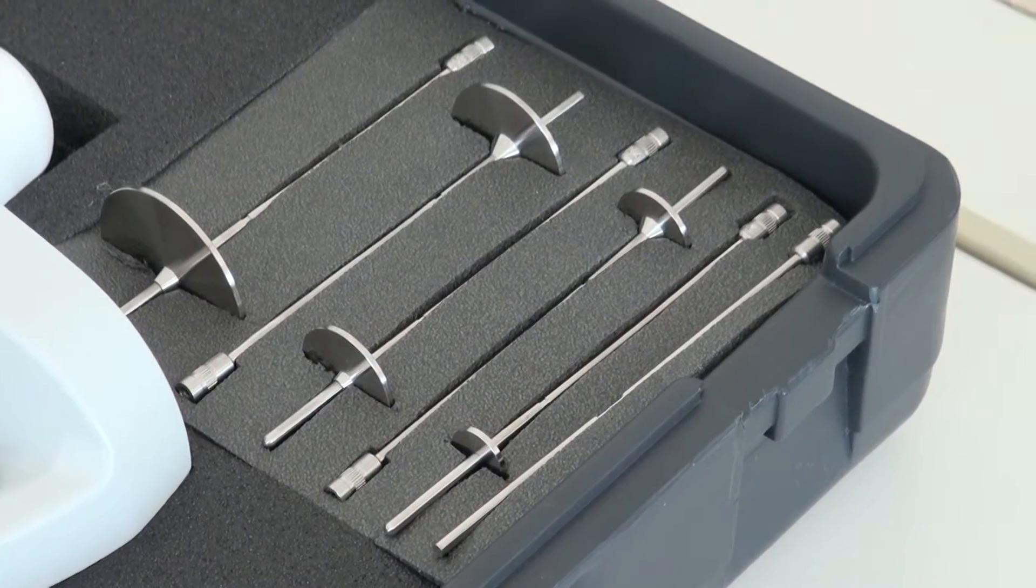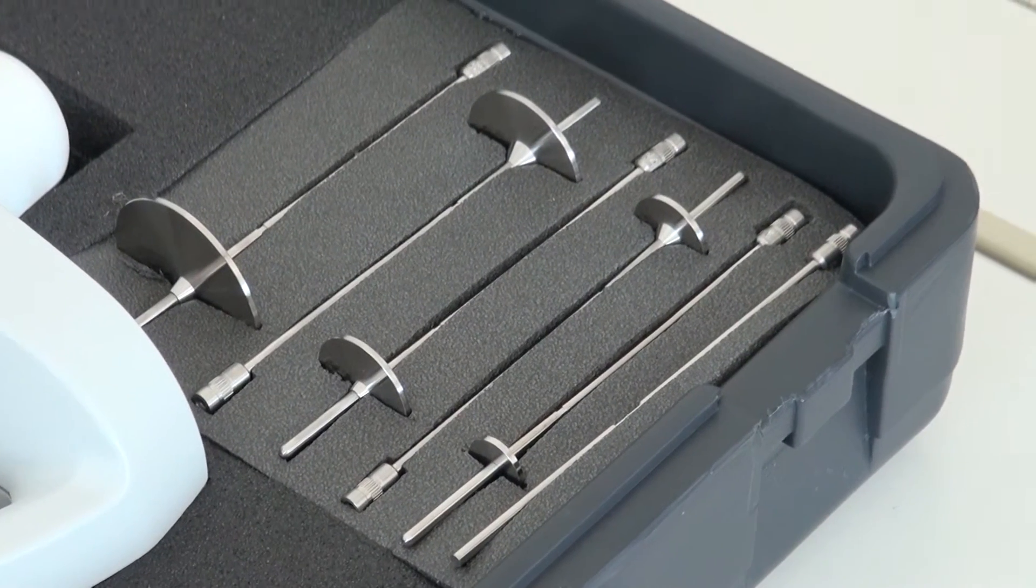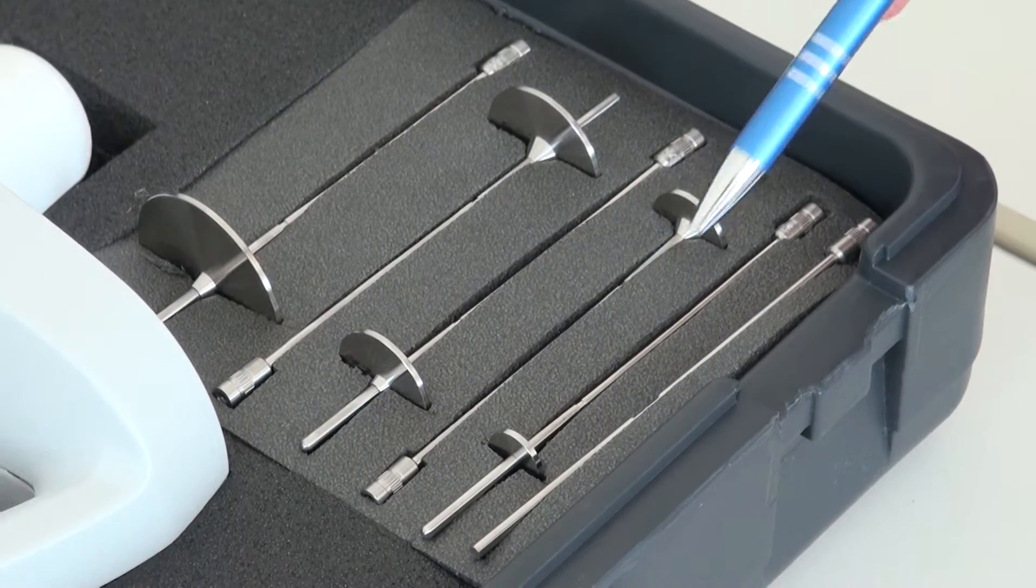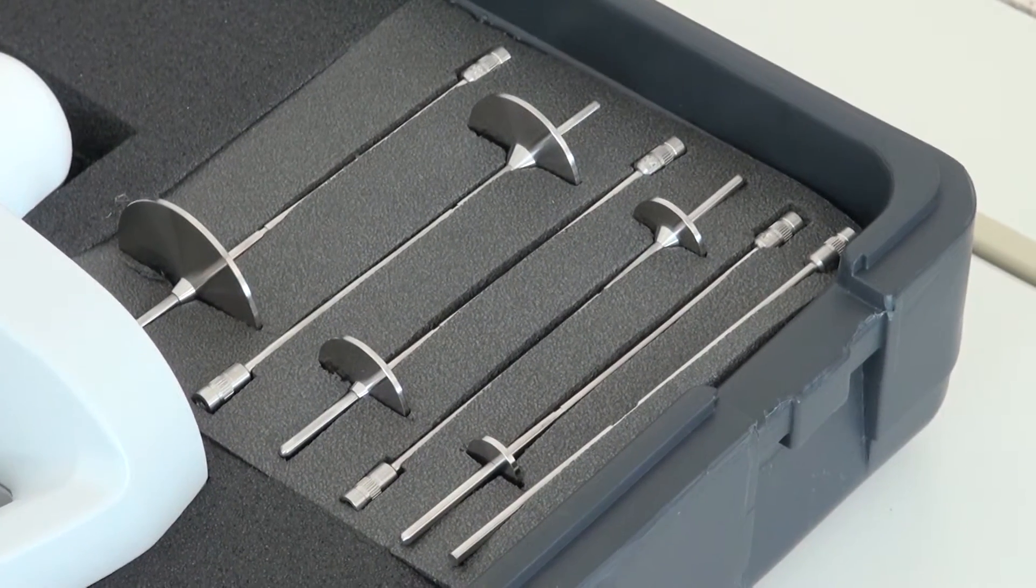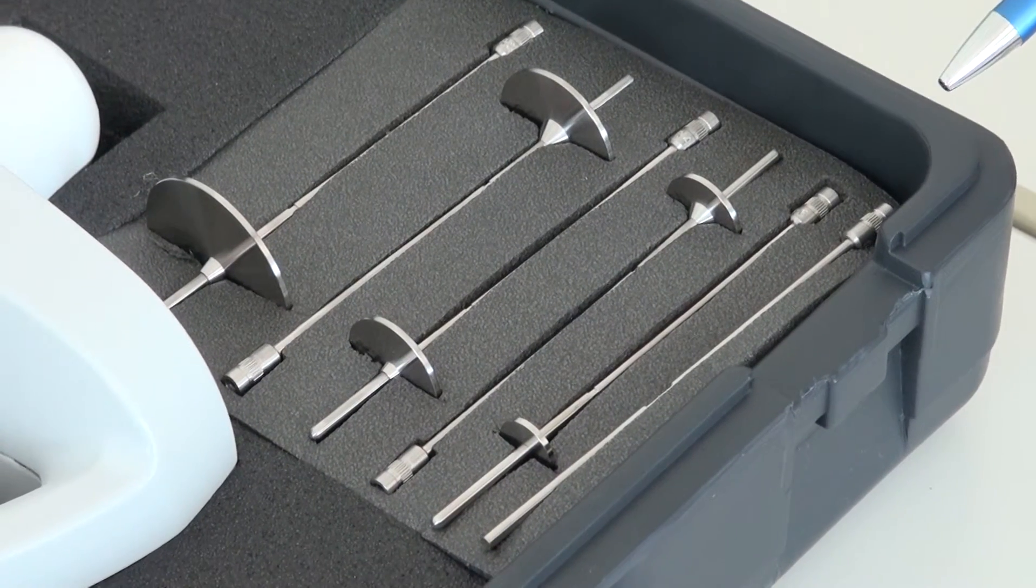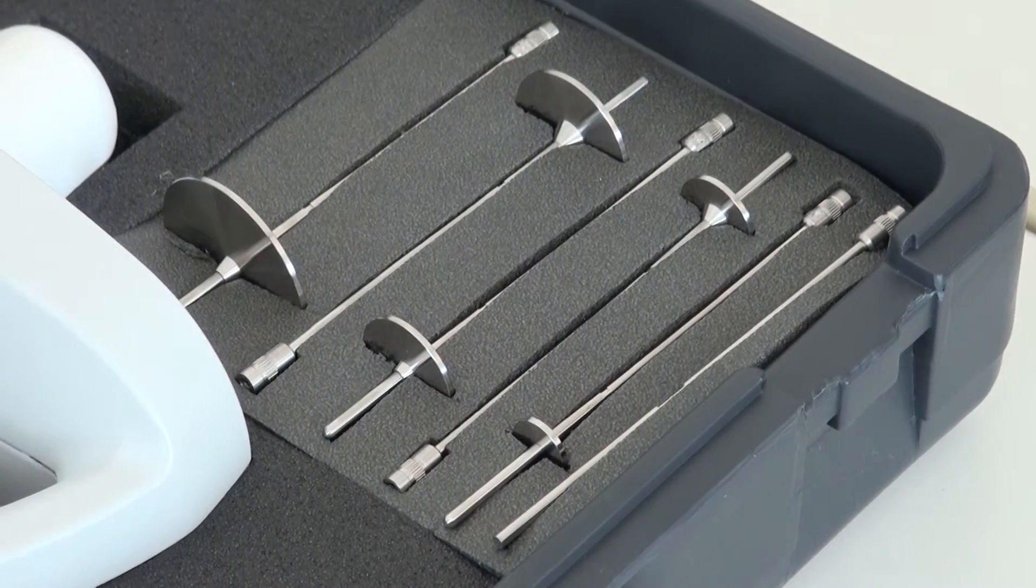The set consists of six rotation bodies, five of them are in the shape of discs and one is in cylindrical shape. Optionally, a further rotation body is available which can cover the lower measuring area.